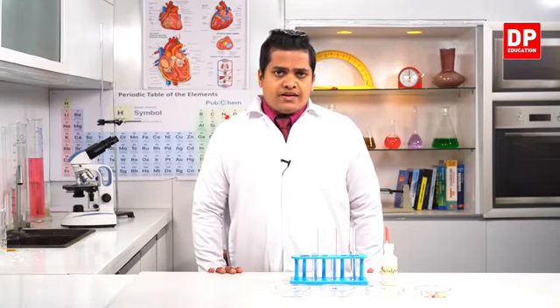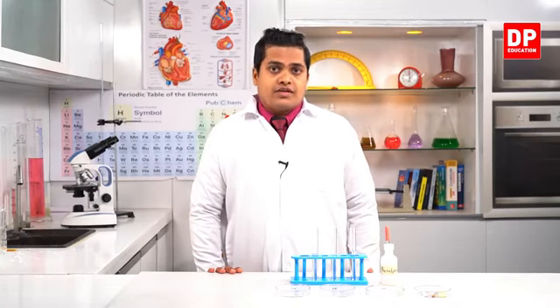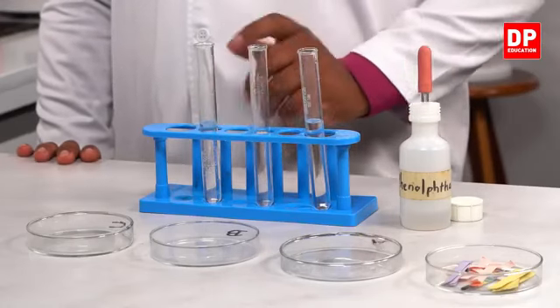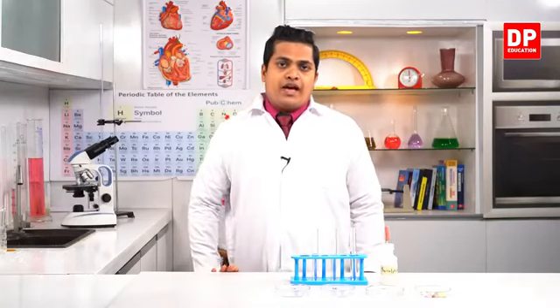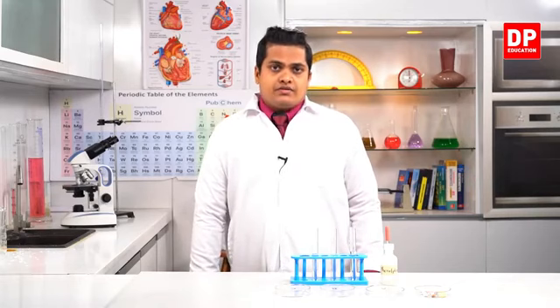Most bases end with the hydroxide part, so sodium hydroxide is a type of strong base that we use in our laboratory. This is sodium hydroxide solution B. C, our common salt solution, does not have any acidic or basic properties. Therefore, common salt is referred to as a neutral substance.